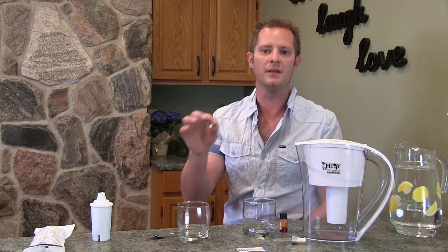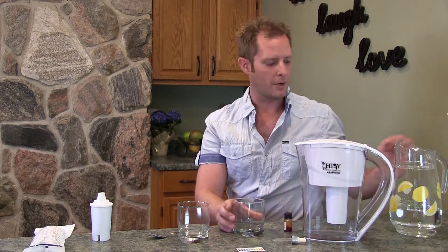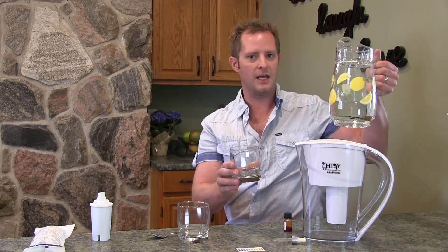My regular tap water is a little bit on the alkaline side normally, but some municipal waters might be slightly acidic. Most of the time they're chemically made to be alkaline because they have to meet regulations on alkalinity.